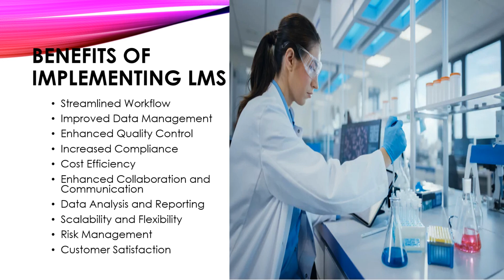Improved data management. A laboratory management system enables centralized storage and management of laboratory data, including test results, experimental protocols, and quality control records. This ensures data integrity, accuracy, and accessibility, which are crucial for compliance and decision making.